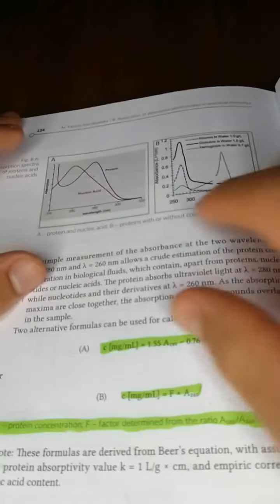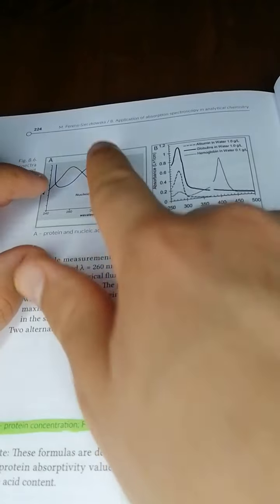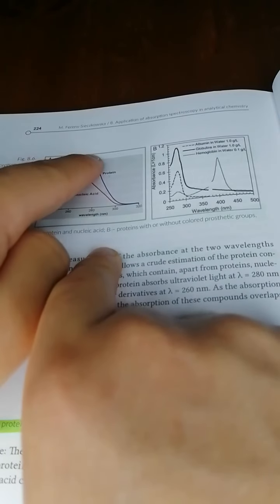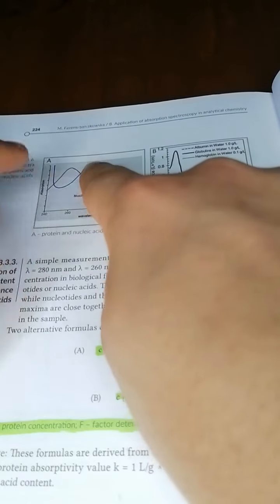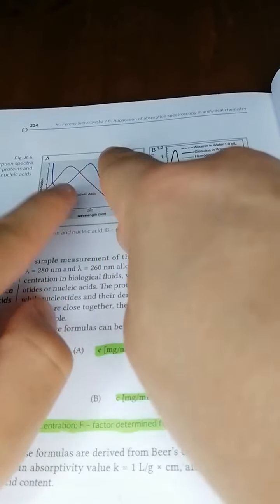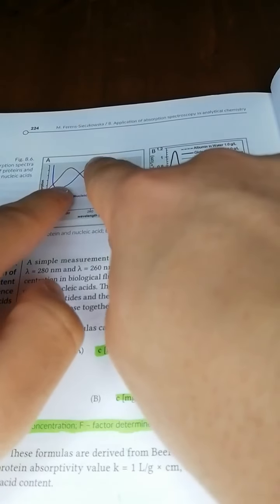And here it shows you the different absorbance of nucleic acids and proteins at different wavelengths. You see that 280 is the peak absorbance of proteins, and 260 is the peak absorbance for nucleic acids. If absorbance at 280 is more than at 260, then it's a protein.